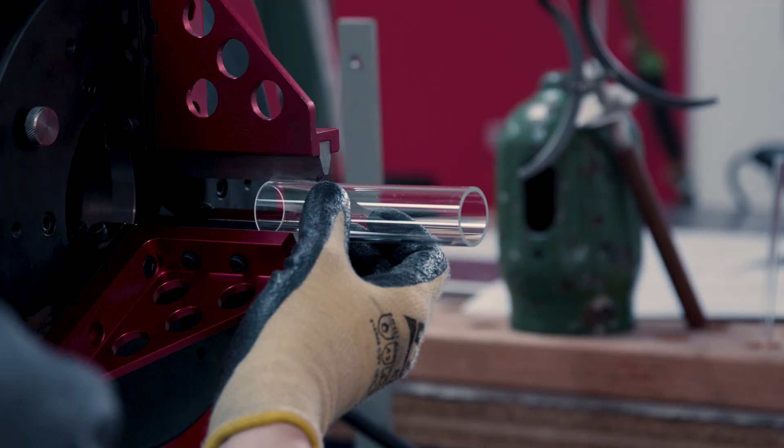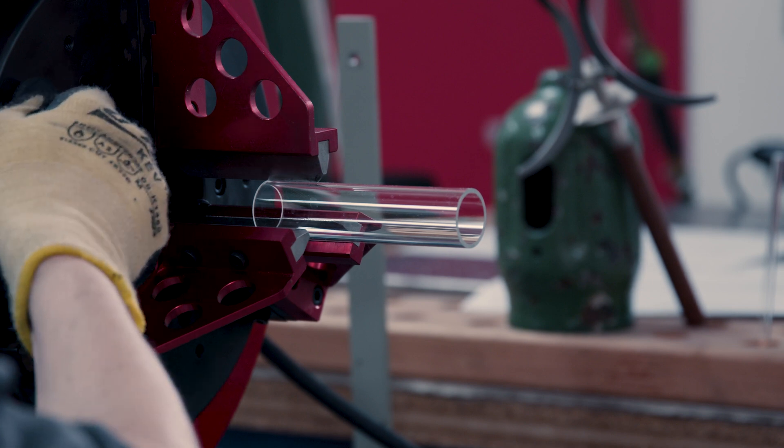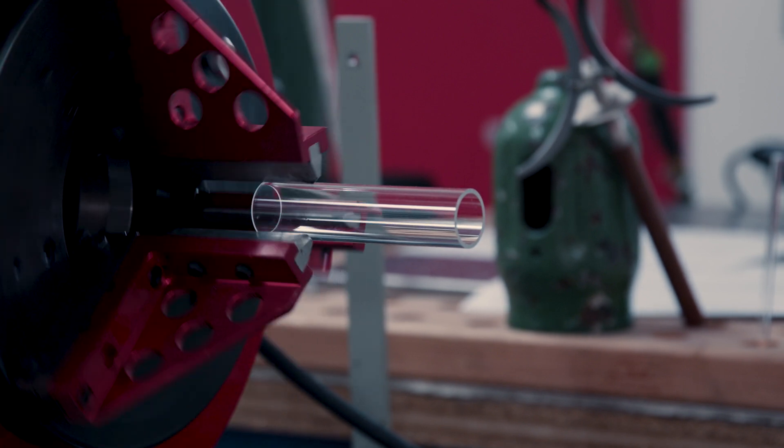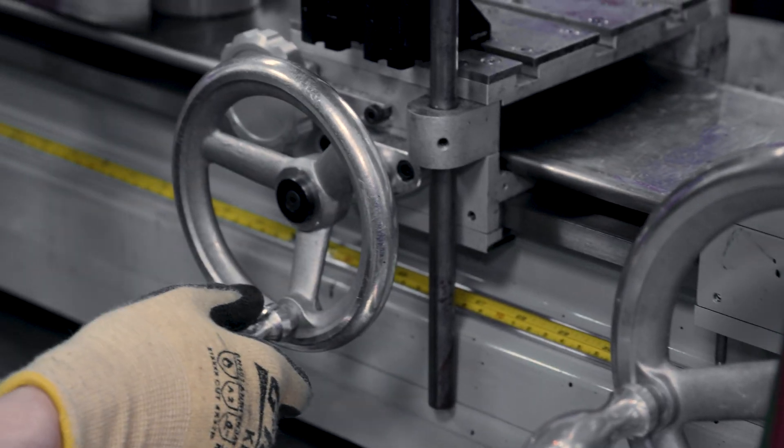It's very important to be particular, especially when it comes to preparing the piece. Part of that is Thor Labs' quality, and part of that is me as a glassblower having pride in what I'm sending out.